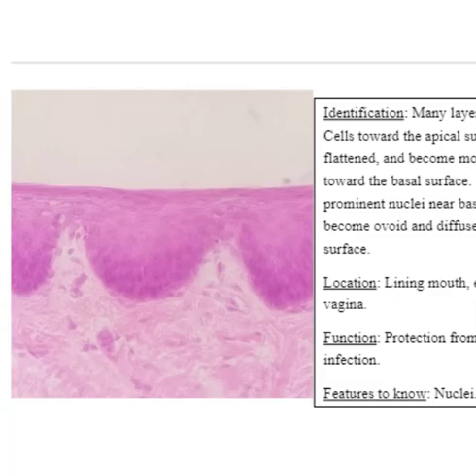So let's go back and look at the picture that I skipped over. This one is the squamous epithelial cells, but they're showing you the layers of the squamous epithelial cells. So here's a layer, here's a layer, here's a layer, here's a layer. So you have many, many layers.